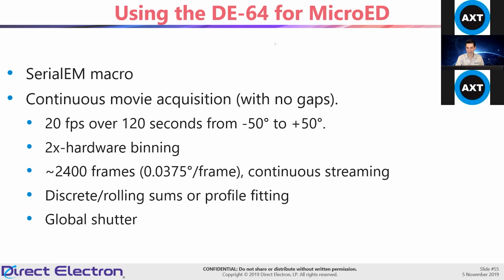Yeah, so this is in fact on the detector itself. This is on a direct detector, a DE64. Yes, people are obviously worried about damage. Like most things, if you're doing electron diffraction, you're going to be using the beam stop.